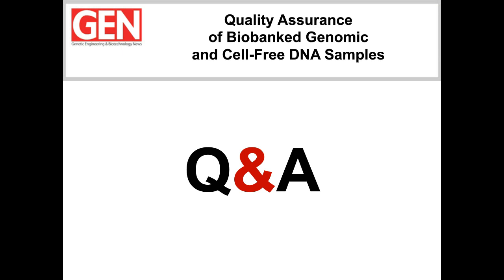Okay, so this is not an easy question. So of course, fixation time is a critical pre-analytical variable, because over-fixation can obviously very much decrease the quality of the nucleic acids that are extracted. So this question I cannot answer directly, but maybe I could give an indirect answer.